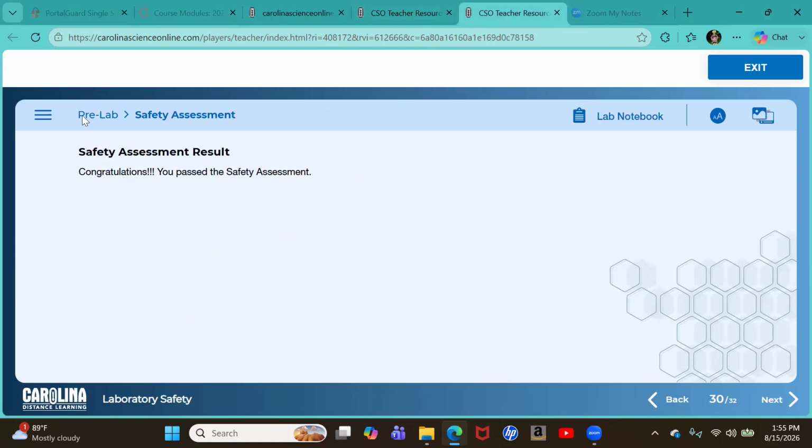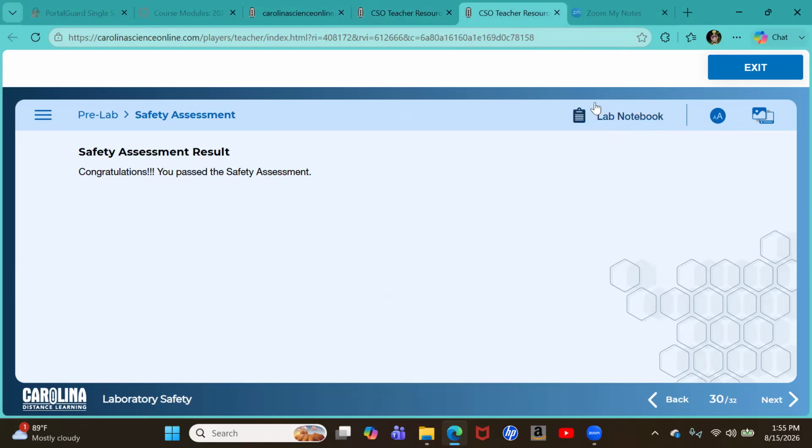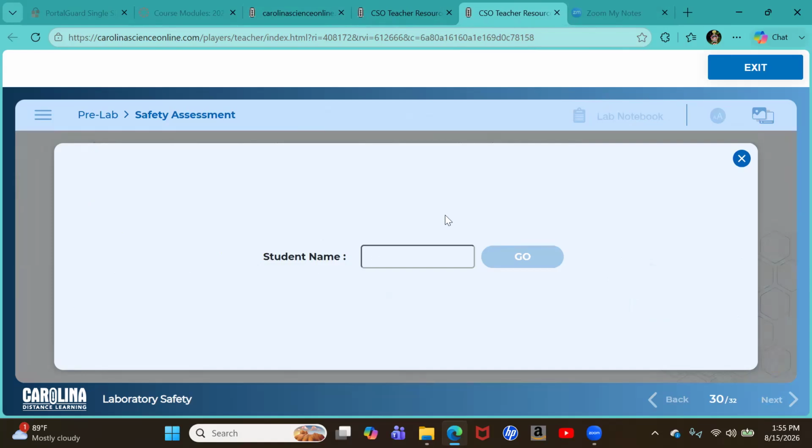And then once you answer the pre-lab questions, which you must get 100 on, now it's time to go to your lab notebook. Okay, we've passed the safety assessment now, and then you see how the lab notebook is open. Here it is not because you haven't passed all of your pre-lab questions. Here it is because, yes, you've now passed all of your pre-lab questions. So we're going to click on this notebook.